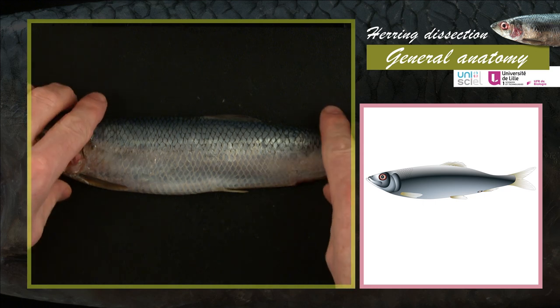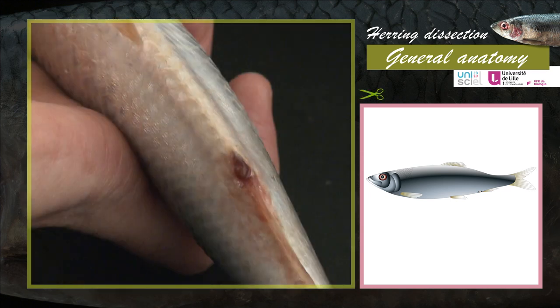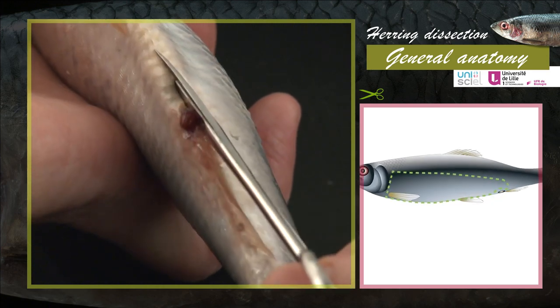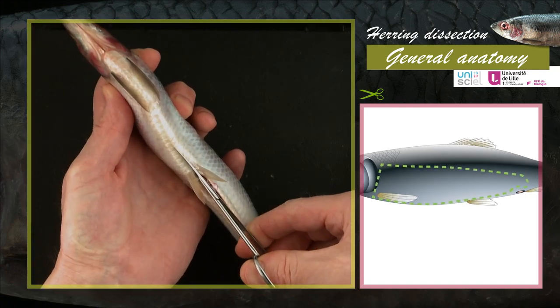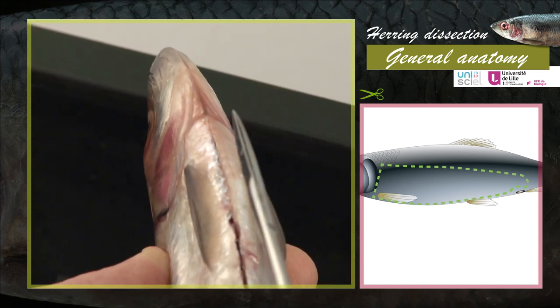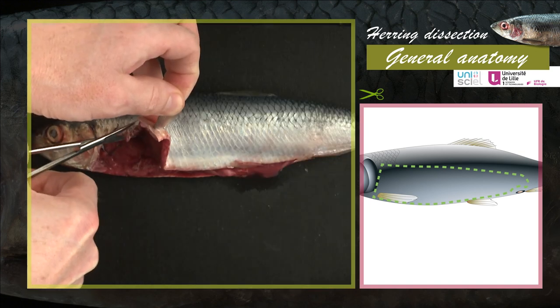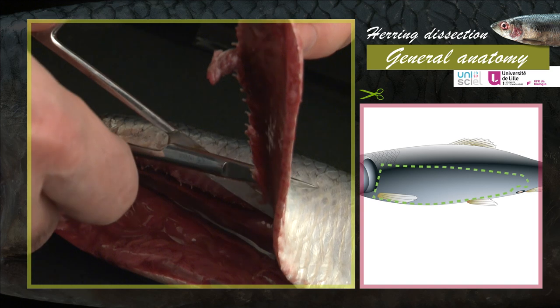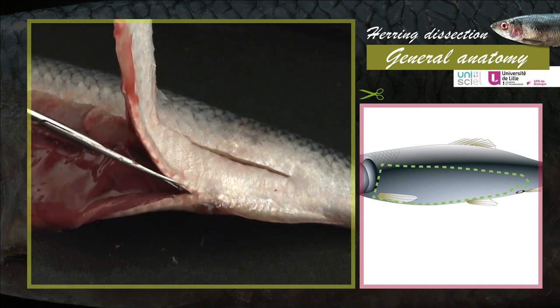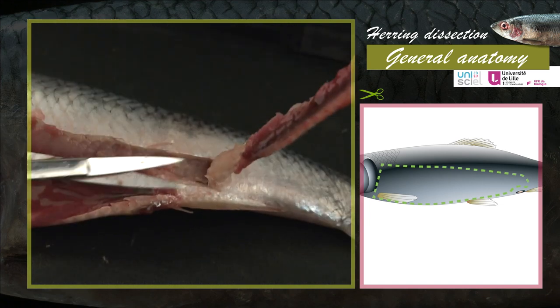To see the internal organisation of the herring, open the abdominal cavity with scissors. Make an incision just ahead of the anal and urogenital papilla. From this slit, cut the skin and the muscles on the medial ventral side up to the base of the operculum. Then go along the left flank towards the back and cut the medial lateral side towards the tail, up to the anal fin. Go around the anal and urogenital papilla and remove the whole muscle section.